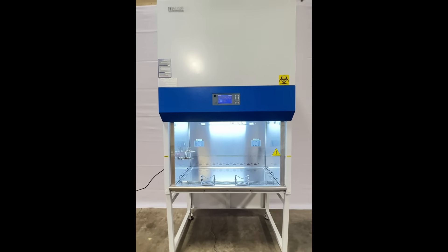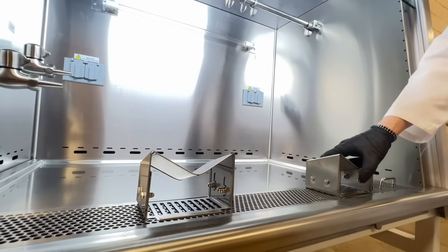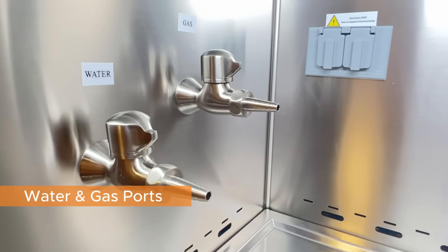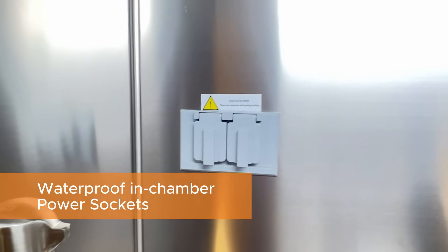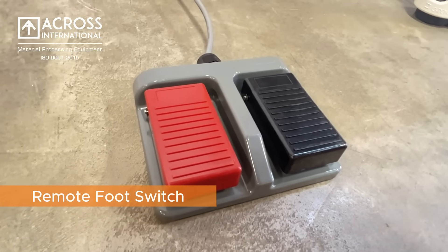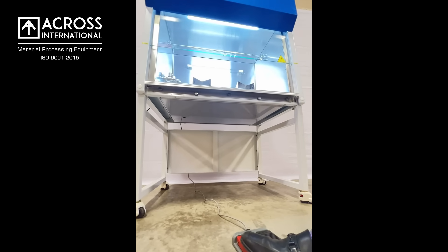Our Across International biosafety cabinets also come with an armrest for your convenience while working, utilities for the water and gas lines, waterproof power outlets, hooks for hanging different utilities that you're working with in the biosafety cabinet, and a foot pedal so that you may raise and lower the sash hands-free while working.